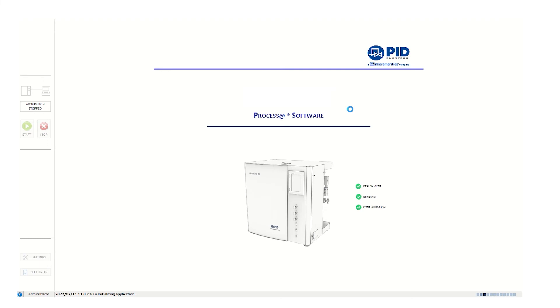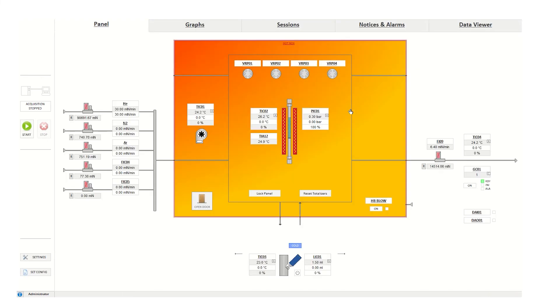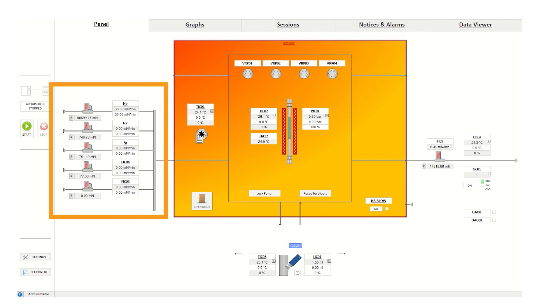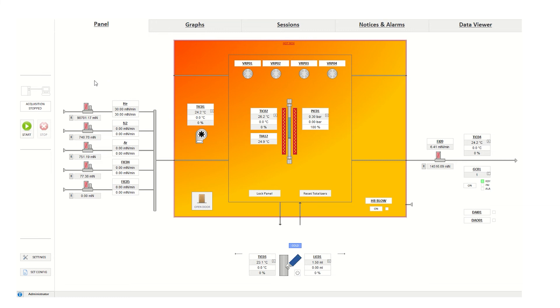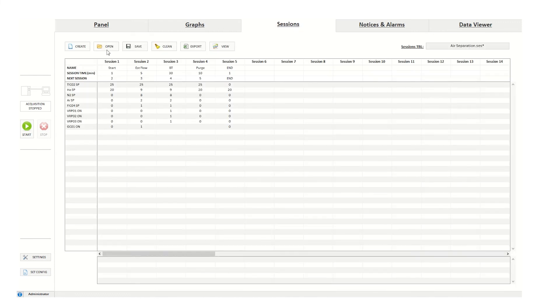On the computer, open the BTA software. This will take you to the software home screen where you'll see the instrument schematic as well as all process variables. You have the option of manually controlling the instrument from this screen, including temperature, pressure, ramp rates, and gas flow rates. First, ensure that the appropriate gases are attached to the instrument. Everything is appropriately set up both on the instrument and in the software, so we are ready to begin with the demo. Next, navigate to the sessions tab and load the appropriate session for the analysis.